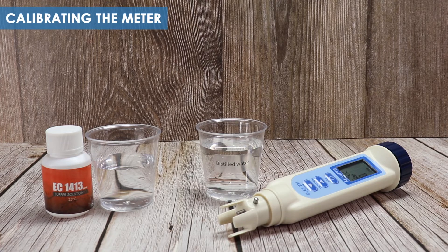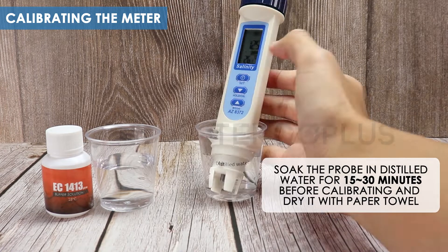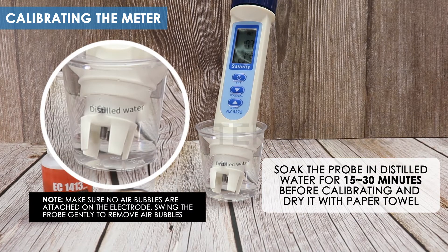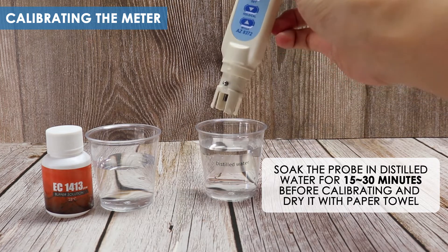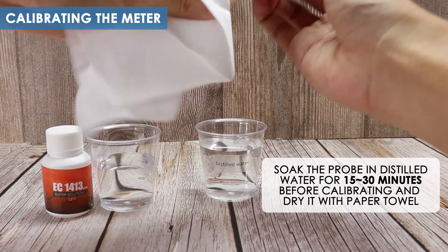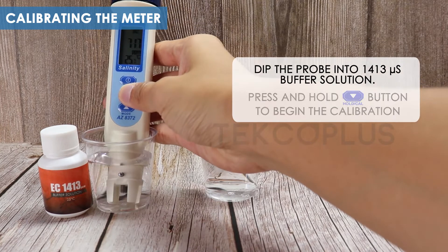Calibrating the meter. Soak the probe in distilled water for 15 to 30 minutes before calibrating. Dry it with a paper towel. Dip the probe into the 1413 microsiemens buffer solution.